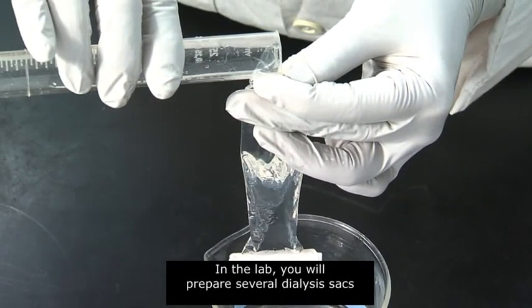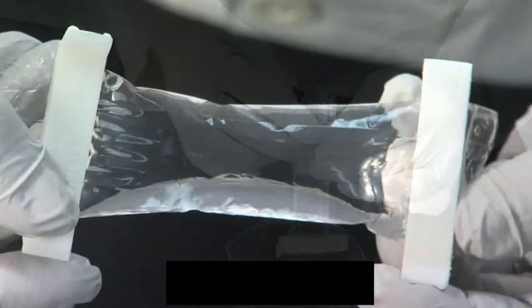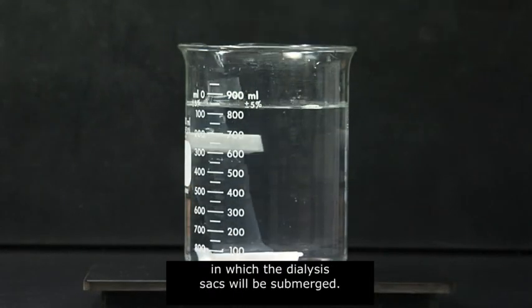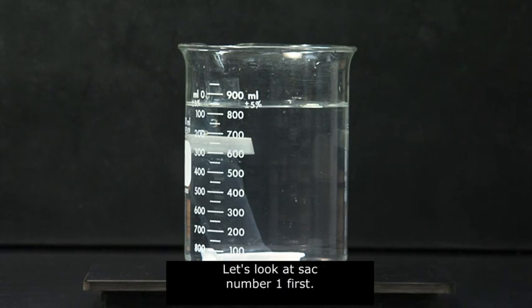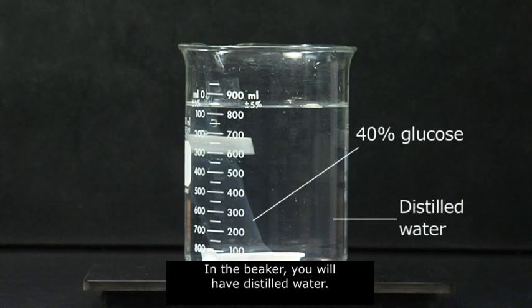In the lab, you'll prepare several dialysis sacs and the corresponding beakers of solution in which the dialysis sacs will be submerged. Let's look at sac number 1 first. In this sac, you'll have a 40% glucose solution. In the beaker, you'll have distilled water.